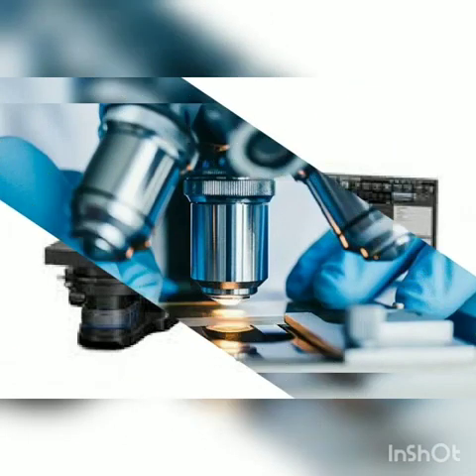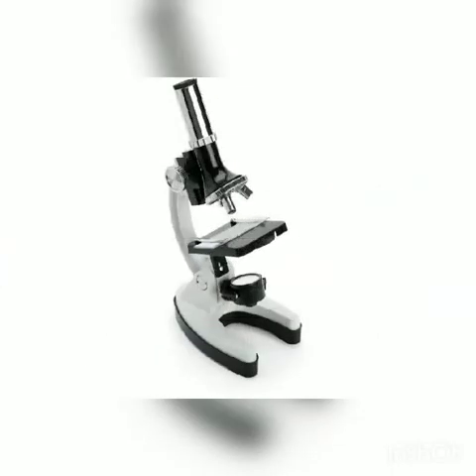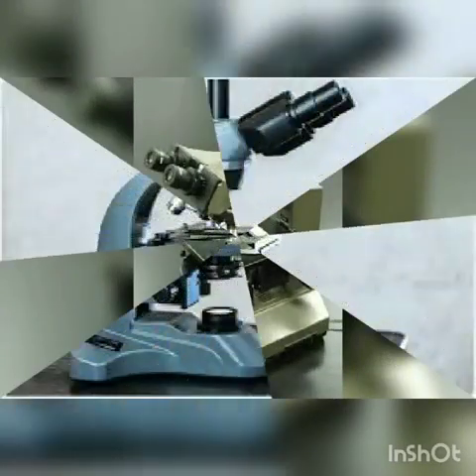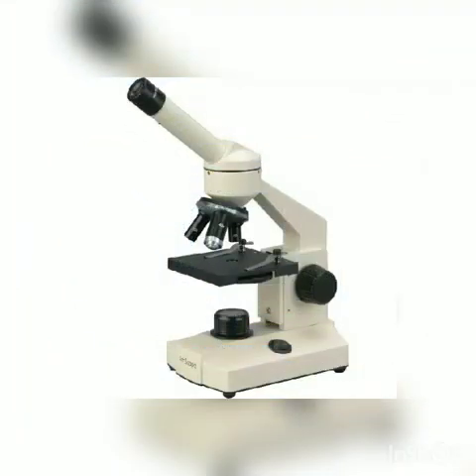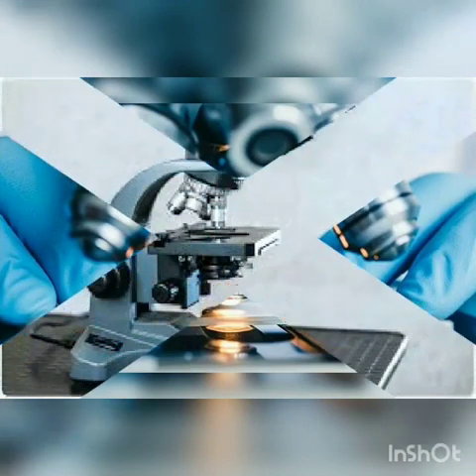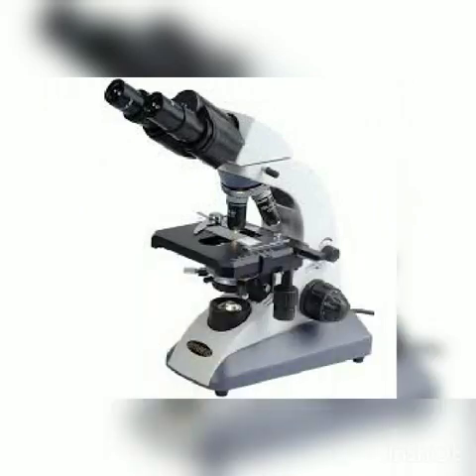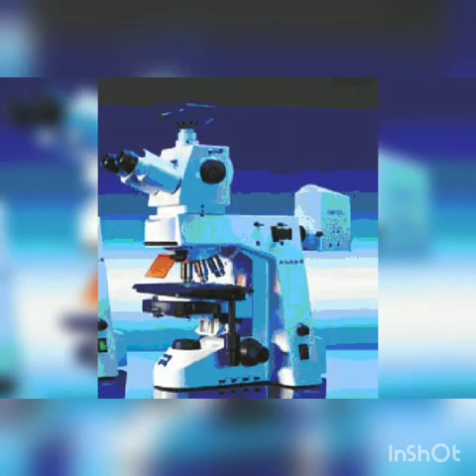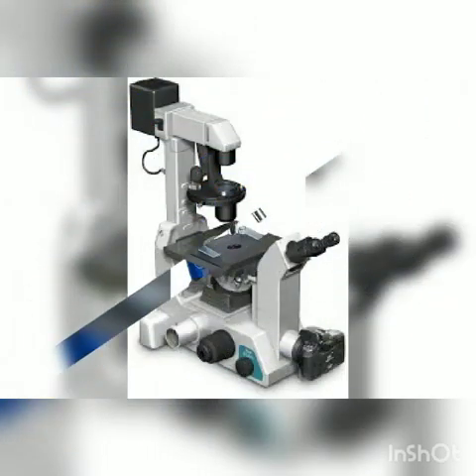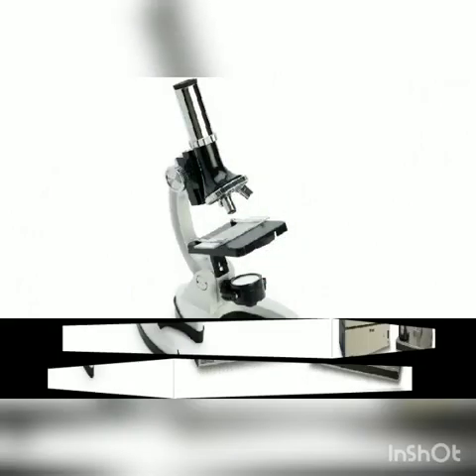Scientists have been improving microscopes ever since the device was invented in the late 16th century, and this process has accelerated markedly over the past decade. The uses of each microscopy technique vary hugely, as do the subsets of scientists that favor them, but fundamentally all are ways of seeing the cell in greater detail than is possible by eye.